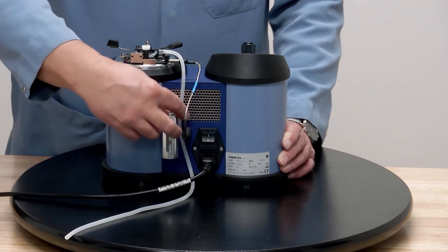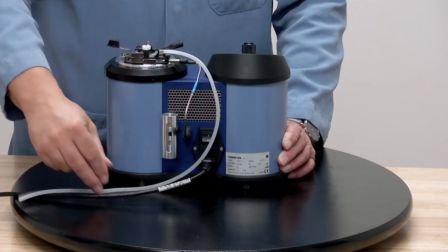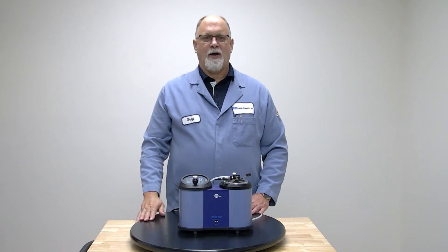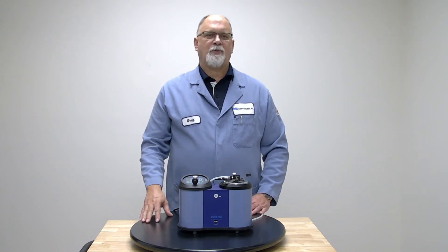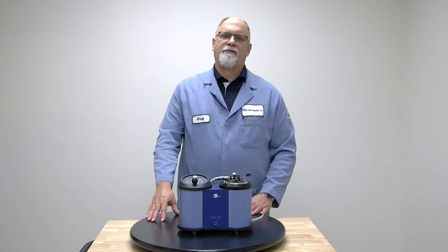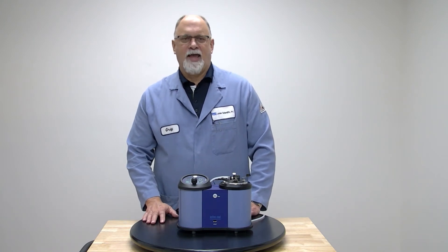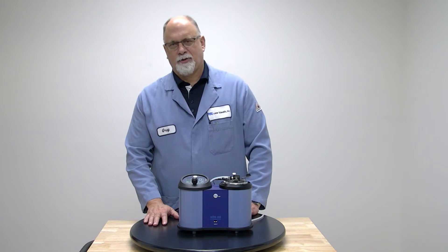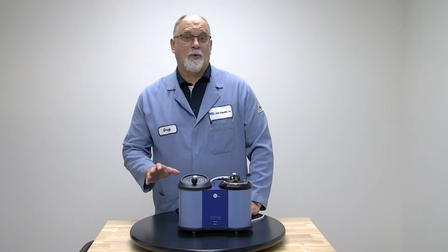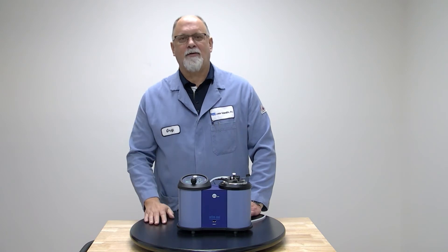Once you connect the power and connect the gas tubing and light it up, you're ready to go. Before you start using the instrument, make sure you're following all federal, state, local, and company regulations and guidelines regarding hazardous and dangerous materials to provide a safe workplace and safe working conditions — which means wear your PPE: usually FRC, safety glasses, and gloves are a minimum.